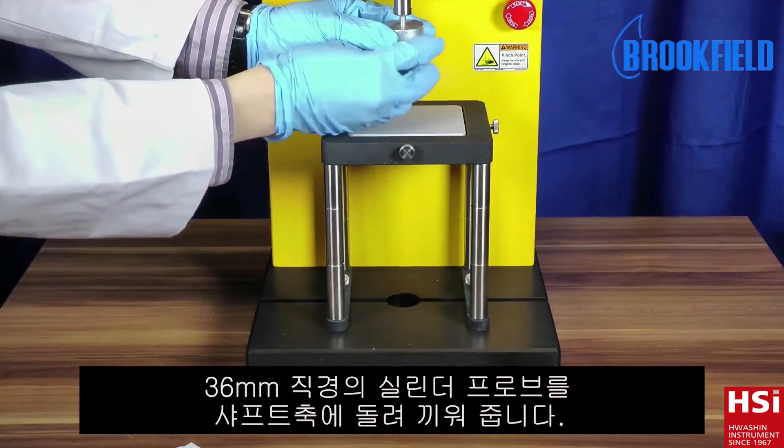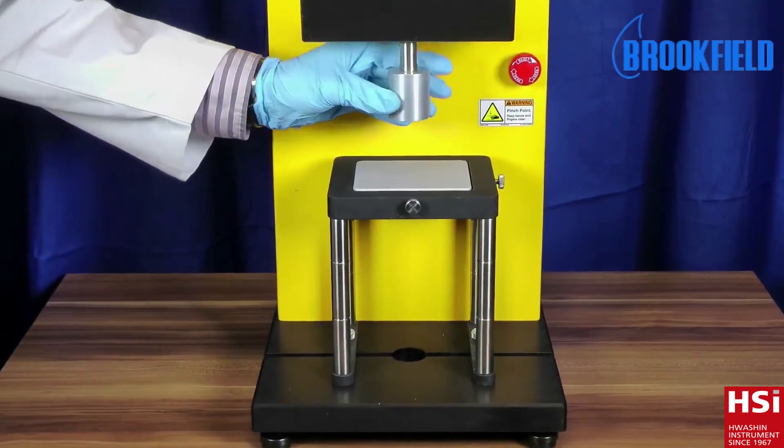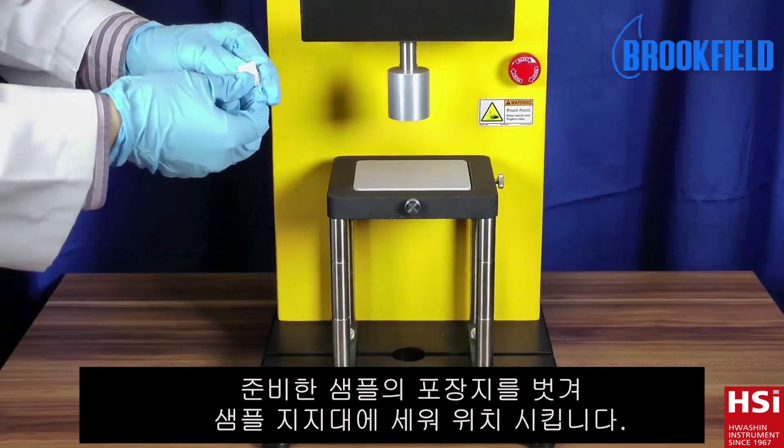Attach the cylinder probe to the probe shaft of the instrument. Remove the tablet from its pack and place it diametrically on the base plate.